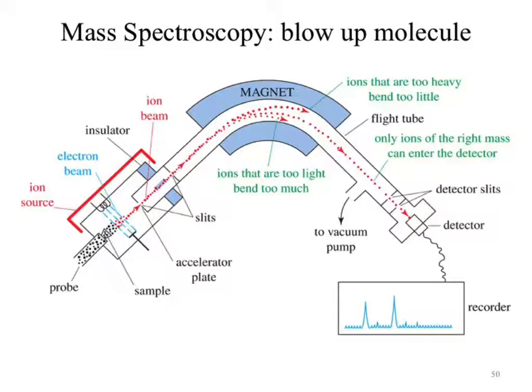We take our molecule, we fire a bunch of stuff at it, and it destroys things. What it's going to do is remove a single electron. Depending on where that electron is located in the molecule, it may fall apart into pieces. Just like if I placed a bomb inside a car versus inside a tank, I'm going to see different results.